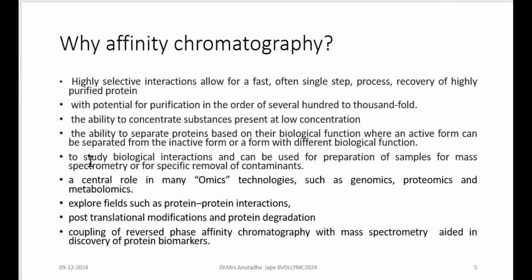You have heard the word omics, like genomics, proteomics, metabolomics. In related studies, you need to have the particular interaction between two different proteins, or if you want to see whether there is any post translational modification happening after the protein is synthesized, you have to have a purified or separated protein from the bulk. In such cases, affinity chromatography works really well.